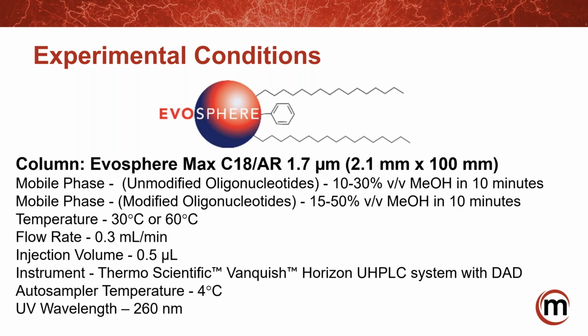Okay, you just turn to the right slide. So in this slide, on the bottom from the second line, your sample temperature you set at -4 degrees C. Is that correct? Is it on purpose or a typo? No, it's 4 degrees C. That's just my dash there. Oh, sorry. Okay, yes, thank you.